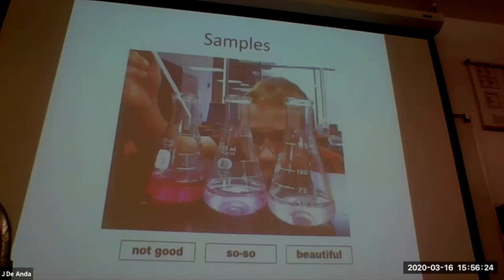And if you find it and then you come and say, Dr. Diaz, come and see my result, by the time I get there, it might have disappeared. It might be colorless again. That's a good titration. That's what we're looking for. All right? It's that faint and that short-lived. Well, it should last about 20 to 30 seconds, at least. What happens is the carbon dioxide in the air makes the solution acidic, so it turns the indicator back to colorless by being there.